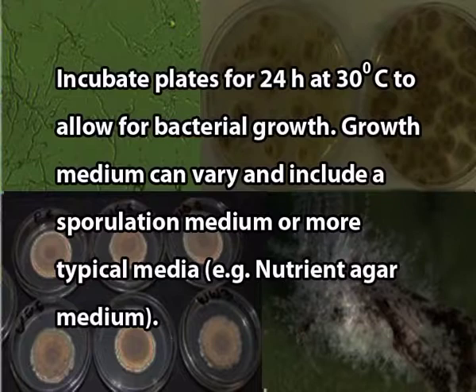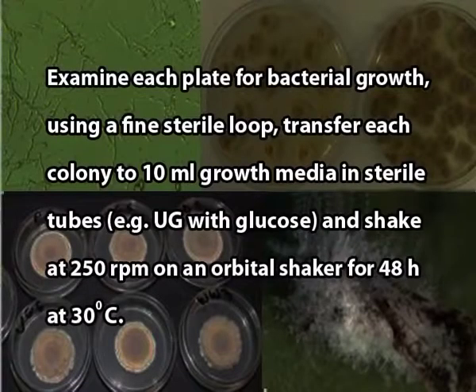These conditions do not allow for selection of all bacteria, just for the most commonly known entomopathogenic bacilli species. Examine each plate for bacterial growth using a fine sterile loop. Transfer each colony to 10 ml growth media in sterile tubes and shake at 250 rpm on an orbital shaker for 48 hours at 30 degrees centigrade.